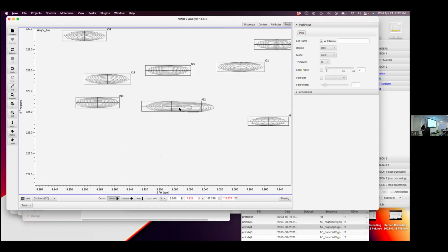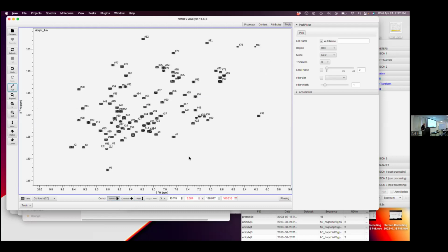So a place like this, it found only one peak. If I hold down the shift key when I pick, then it forces it to pick exactly where you clicked. If you don't have the shift key, it actually searches and finds a local maxima, and it would have gone back and found the original peak. So that lets you have explicit control over where peaks are.